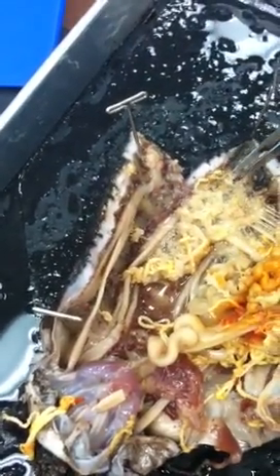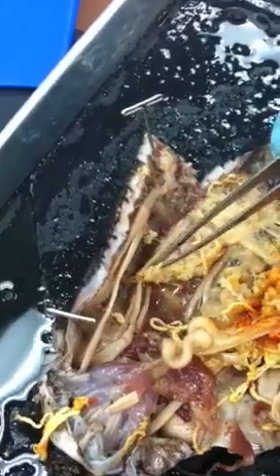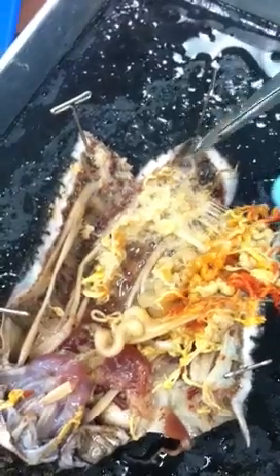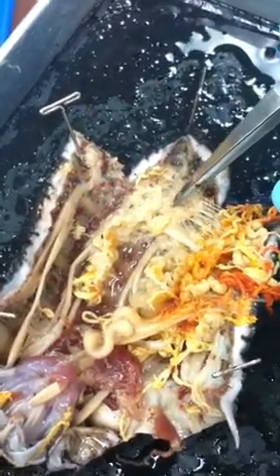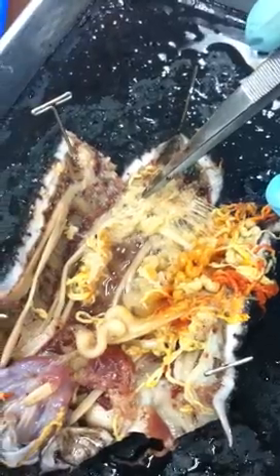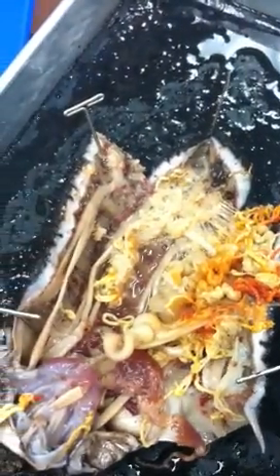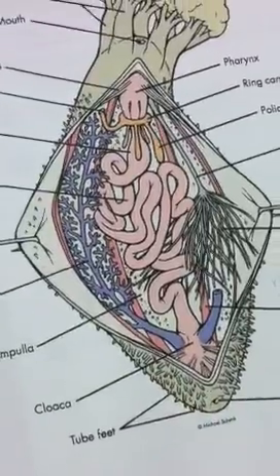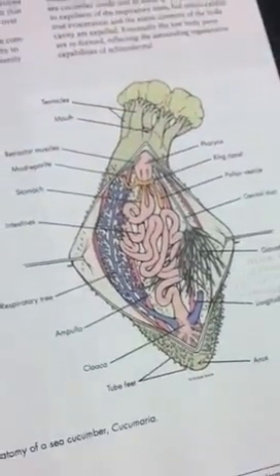And those are just gonads intertwined between there. Yeah, this is just gonads. What? It respires through pumping the cloaca. Right. Well, so it brings the water with oxygen in that way, but the actual respiration happens in the respiratory tree, which is a branch. So if you look on the cloaca, there's like this purple branch that comes off in your picture. That's the respiratory tree. Do you see it? So it pumps the water in and then it goes to the trees and respires. Yes. Right, and that's where gas exchange happens.